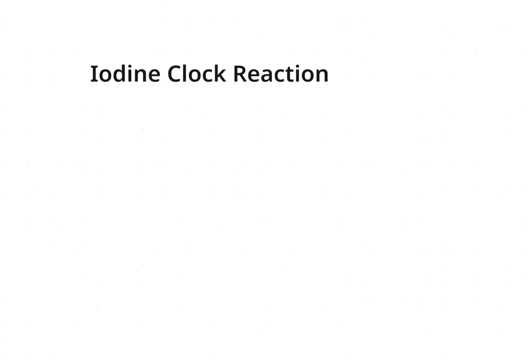Right? It makes it easy to study kinetics because if you think about it, what is the kinetics of a reaction? It's how fast the reaction goes. So we're measuring the time. To measure the time, we need to use a stopwatch. So we need to be able to see a sharp change in color, or anyway something measurable, so that we can actually stop the stopwatch and record that time.